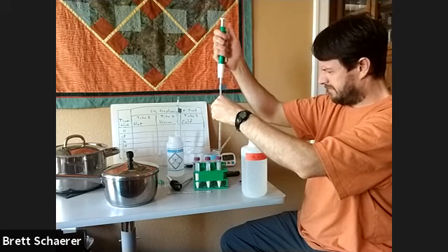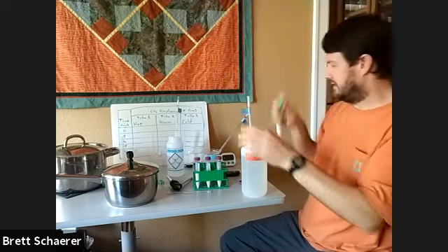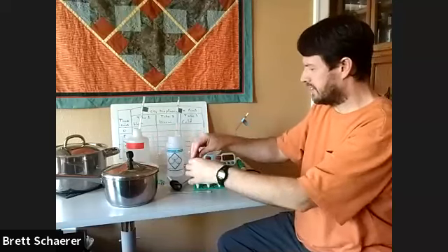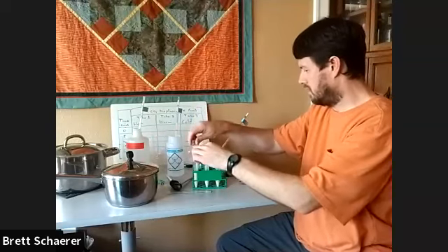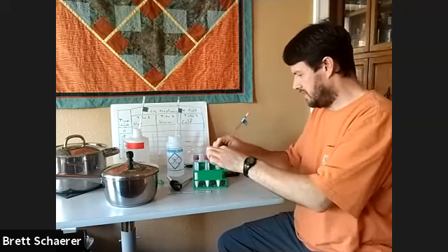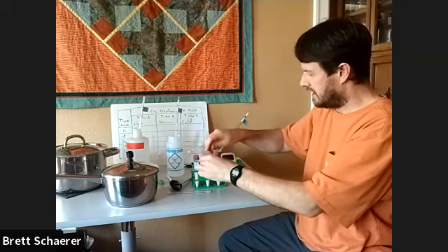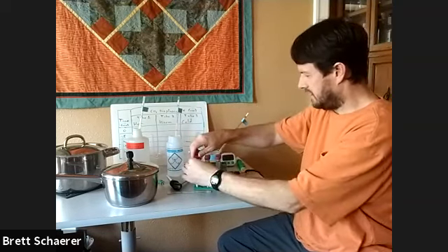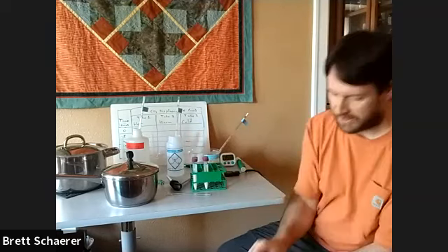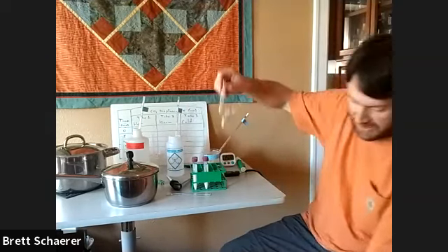Okay, that is all of the solutions we need. And we'll put these into their environments. Again, I'm having these nice and tight. Okay, so these ones are going to go in the cooler, chill out for a while, and that is going to be tube number 3 as well. So I'm going to put that in the cooler.